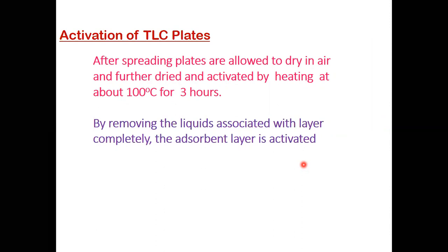After 2 hours or 3 hours, remove the plates from the oven, and now TLC plates are ready for analytical purposes or analytical studies. It is important to note that you can also store these plates to protect from the moisture, and you can use these plates within 3 days.